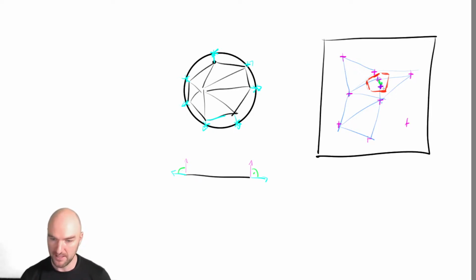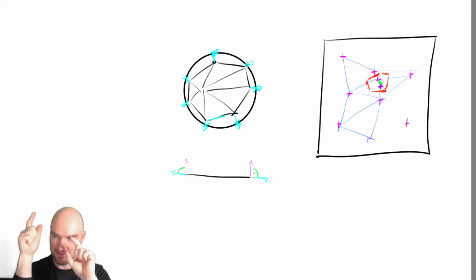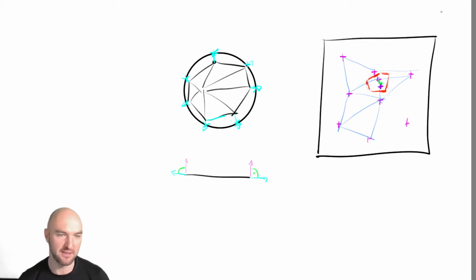entire flat. And what it then does is it takes that map, randomly throws in points, and uses these algorithms, Lloyd's algorithm, centroidal Voronoi tessellation, it's also called Lloyd's algorithm very often, to distribute those points in space, and then moves from point to point. And this is why the robots move that way, because they move from point to point in their domain.